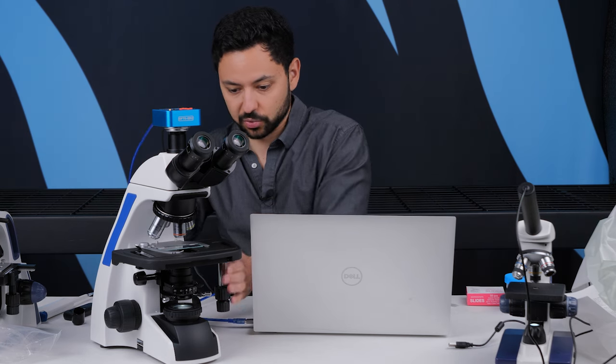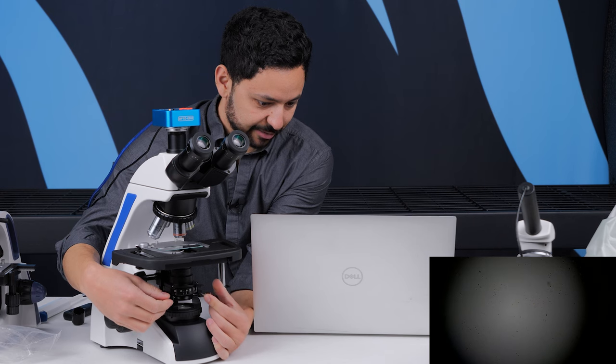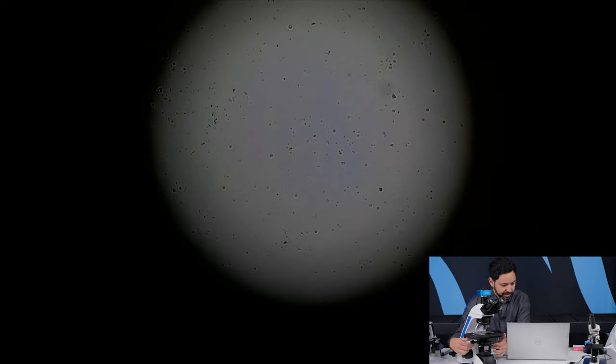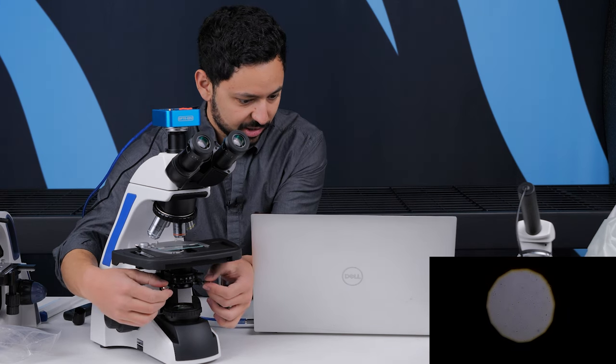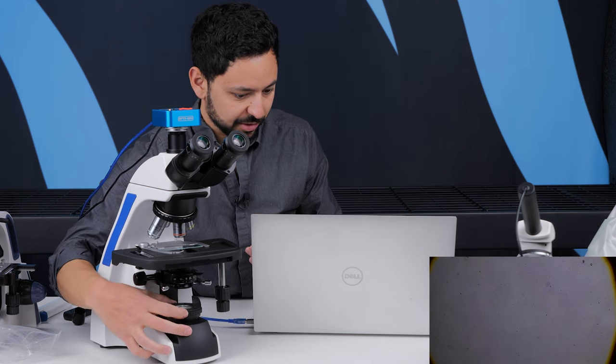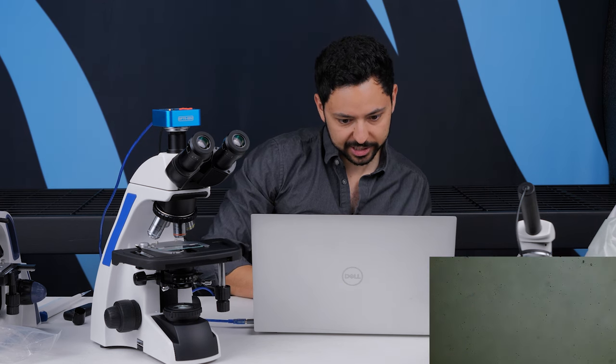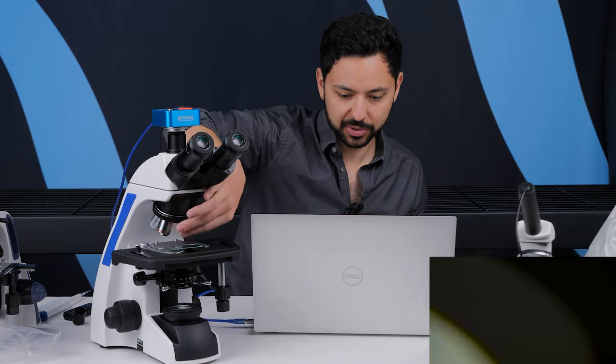Reach around. So first thing is that I'm going to need to get it into Köhler illumination. Start with the field, closing down the field diaphragm. And now I need to align the condenser close enough. And now you can adjust the height of the condenser so that you can see the fringes of the iris of the field diaphragm. All right, now you can recenter the condenser again because now it's changed. Now you can open up the field diaphragm to be full. And it looks like my exposure on the camera is doing okay. Maybe crank it up just a little bit. You know, really, you got to nail the exposure here if you want the ideal settings on the camera. Okay, so that's all set up now. We're going to go up to a higher magnification.